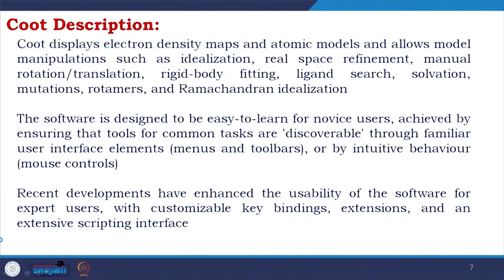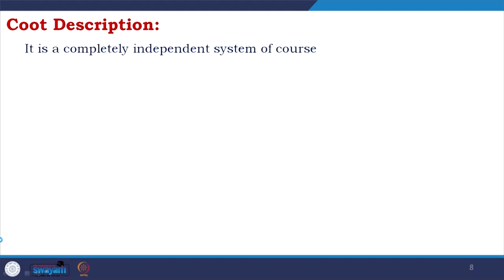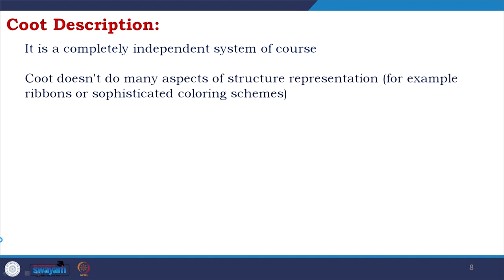Recent developments have enhanced the usability of the software for expert users with customizable key bindings, extensions, and an extensive scripting interface. It is a completely independent system. Coot does not do many aspects of structure representation.